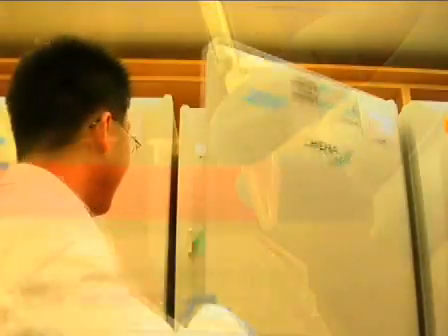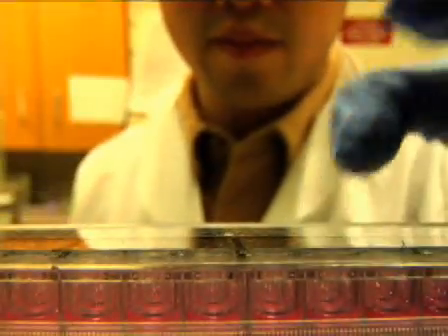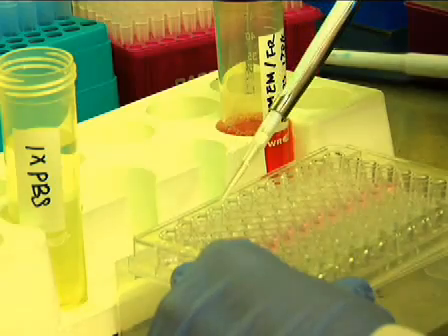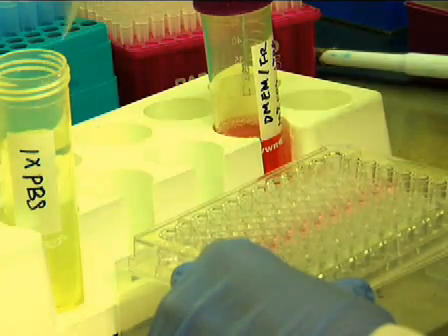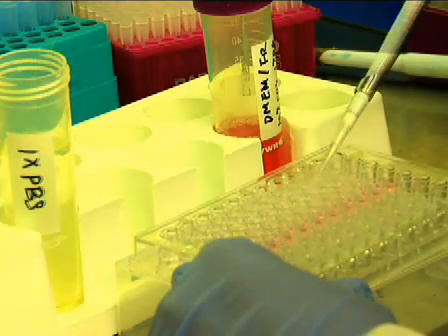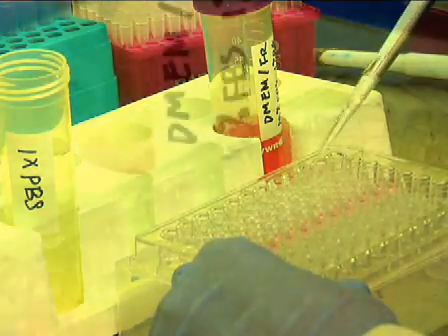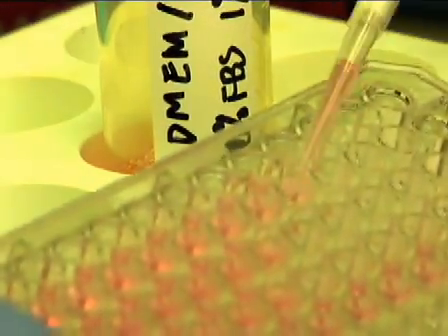In such cases, incubate the cells with the beads for 30 to 60 minutes to allow cells to phagocytose the beads. After this incubation, the cells are washed 2 times with PBS to remove unincorporated beads. Then fresh media is added and the cells are incubated for 6 to 16 hours for reporter gene expression. Now we are ready to proceed with the luciferase assays.